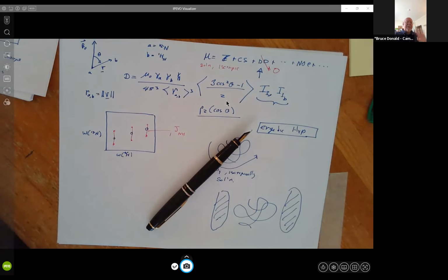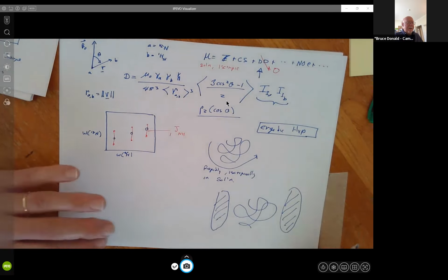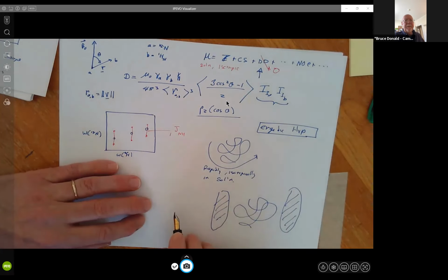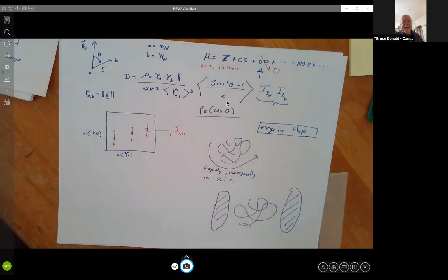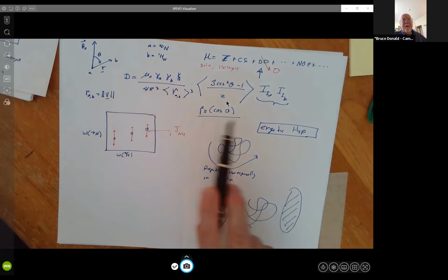But as you titrate these things in, if 1 in 20,000 times it encounters either steric or charge hindrance from these big walls, then you're biasing the equilibrium distribution of orientations. So all of a sudden, it's not tumbling isotropically, and you have an anisotropic bias. In other words, you have an actual distribution that's not uniform over rotation space. And then you can experimentally see these signals coming back.